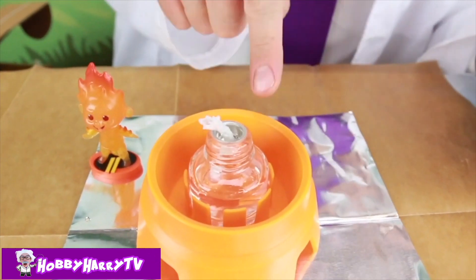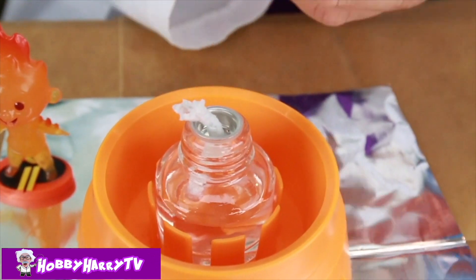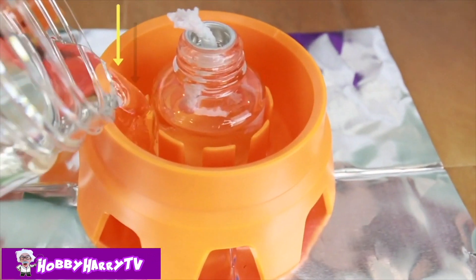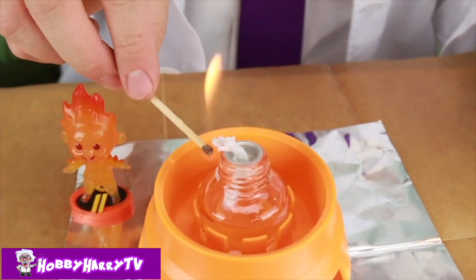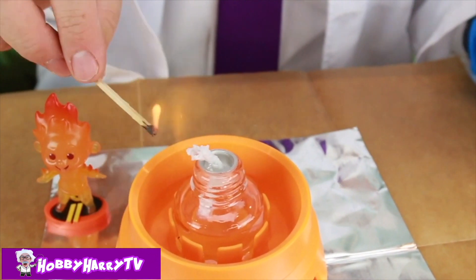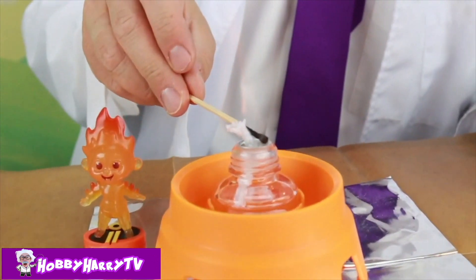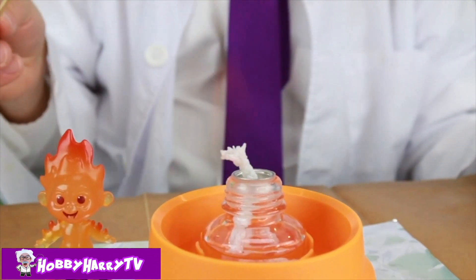Baby Jack Jack is ready! We have our glass little bottle filled with methanol, all ready to go! We're going to get a match and light this. But first, we're going to put some water around the glass! Ready, Baby Jack Jack! Can't even see the flame on here, but it is definitely on fire, guys! It is definitely on fire!